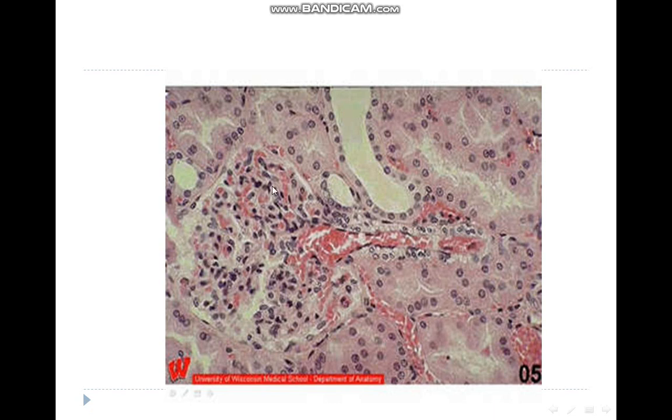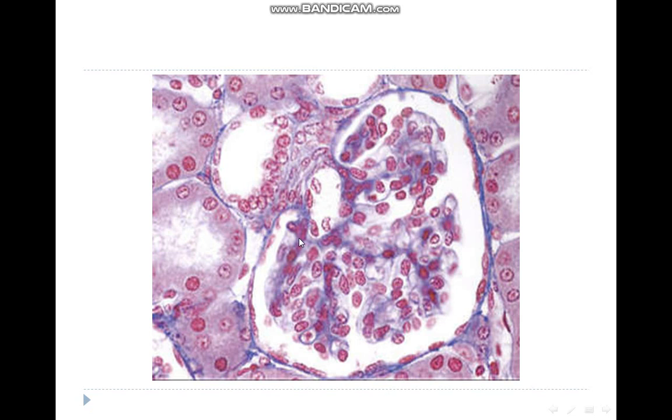In this figure, we can see the renal corpuscle, and this is the efferent arteriole of the renal corpuscle. Also, we can differentiate the proximal convoluted tubule and this region of distal tubule, an elongated section. This is a distal convoluted tubule, lacking a brush border, while this is a proximal and this is a distal. This section of the distal, adjacent to the vascular pole of the renal corpuscle, in which the nuclei are found in a single row, is called the macula densa. So the renal corpuscle contains a vascular pole, and we have an adjacent distal tubule containing a row of nuclei of the macula densa.